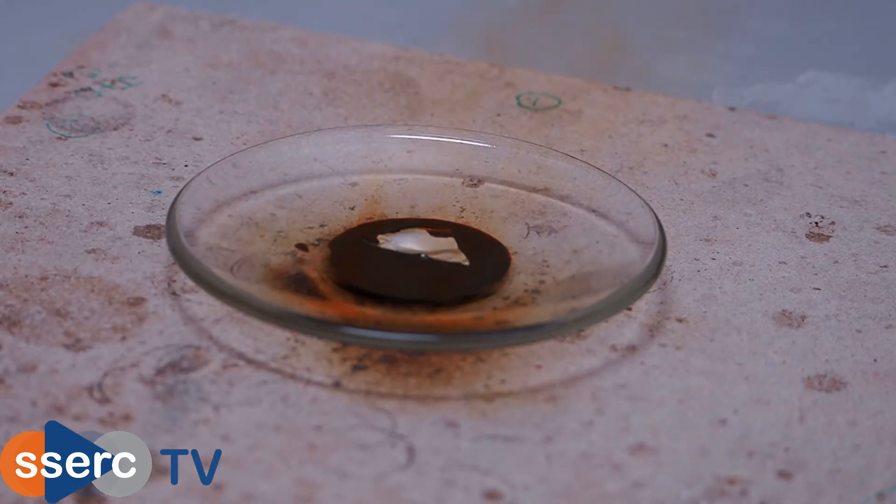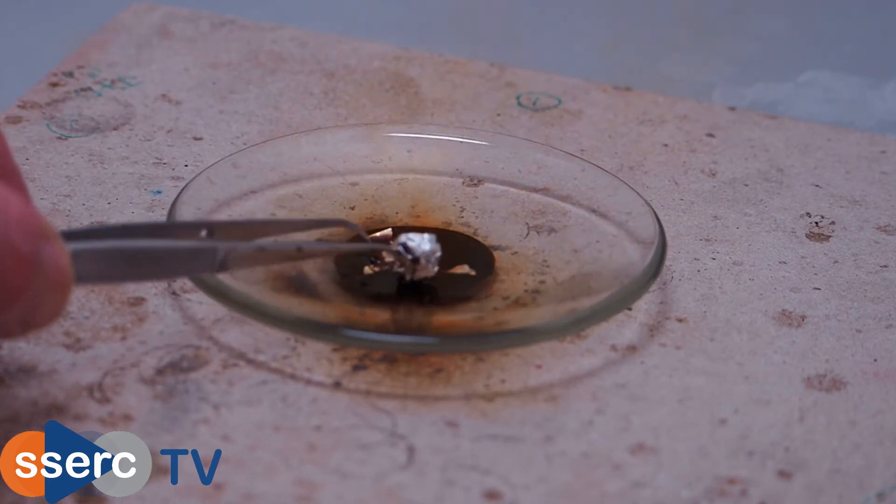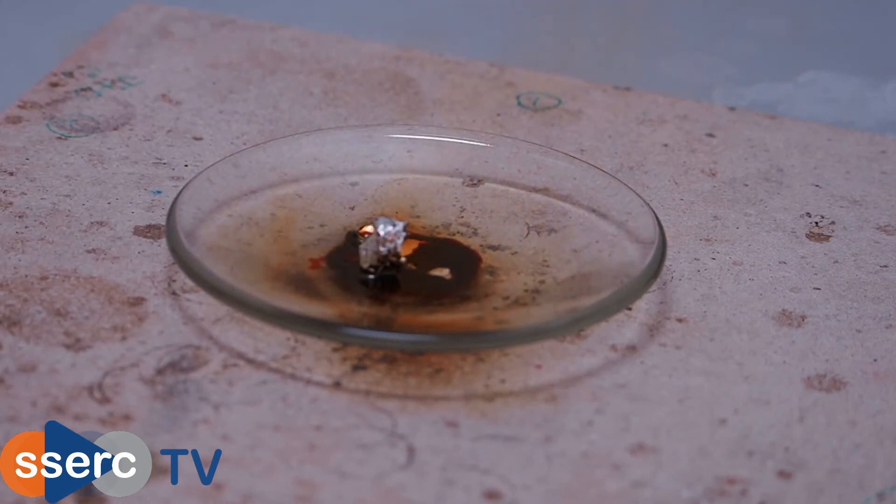A millilitre or so of liquid bromine is placed in a watch glass in the fume cupboard and a few pieces of aluminium foil are put in. After a little while you can see some sparks appearing before the mixture flares up, producing whitish fumes of aluminium bromide as well as the red-brown bromine vapour.